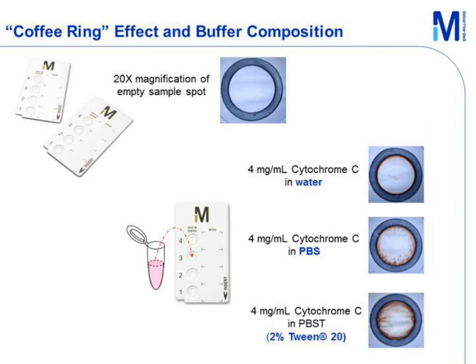What additional things are connected to our analysis? Any water-based sample spotted on any hydrophilic material is drying, forming a so-called coffee ring. To retain the material within a certain area, an embossing ring has been added to the sample spot.